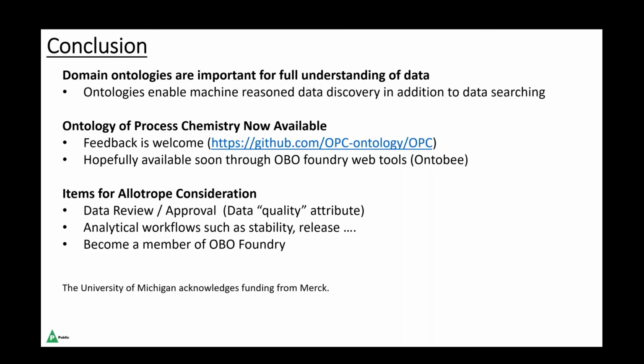Also, in the end, we would like to provide some items for Allotrope consideration. We think data needs to be reviewed and approved with some data quality attributes, so we can better review the data and give approval in the end. We will also need some analytical workflows such as stability and release, to support the analytical study of the workflows.